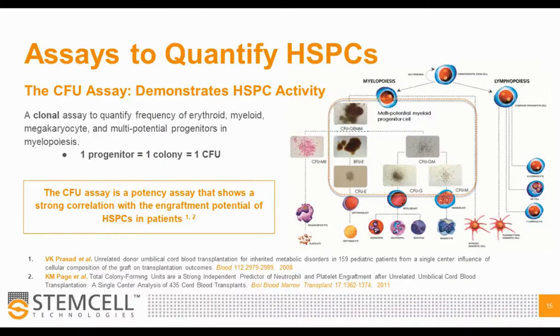And you can see that by the CFU-GEMM image shown here, where you see red cells as well as other cells surrounding it, versus the ability to actually look at more lineage-specific progenitors. For example, BFU-Es are from the erythroid lineage and CFU-GM from the myeloid lineage. And the ability to actually watch a single cell in semi-solid media expand and grow in culture in a spatially identifiable and separated way then allows you to really count and look at what is the frequency per cells plated, and am I really getting the appropriate and the normal erythroid and myeloid ratio, as well as platelets.